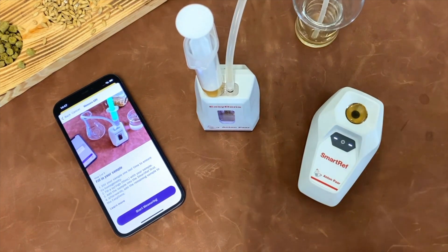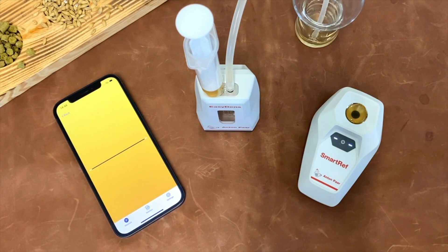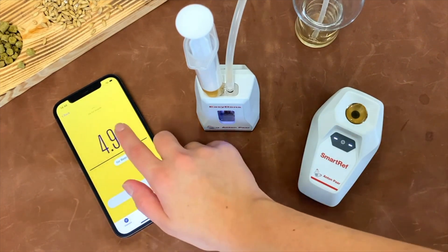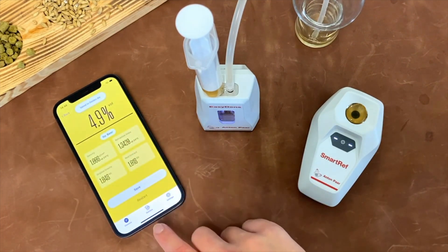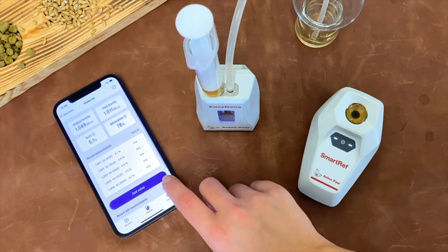Then via the app, you are ready to tap the start measuring button and then follow by tapping the ABV measure icon in the middle of the screen. After a short time, you will then have your data and if you wish, you can check further within the app for more information, which includes the density and gravity plus much more as you can see here.